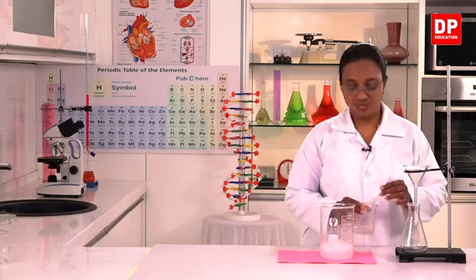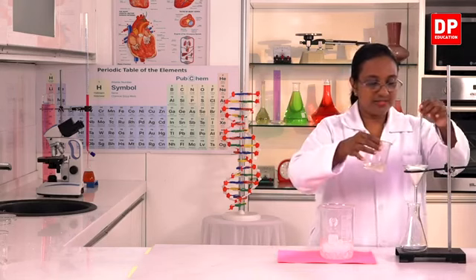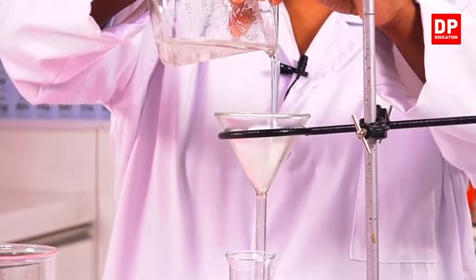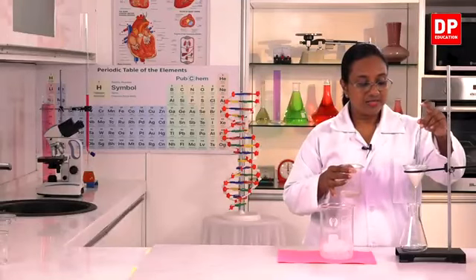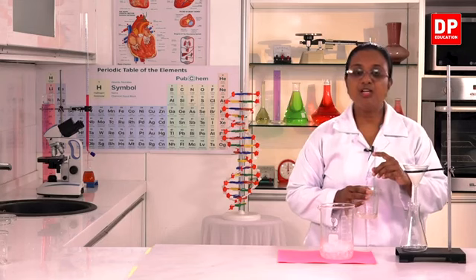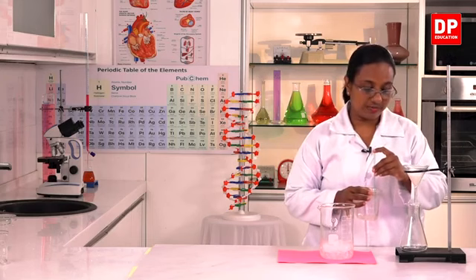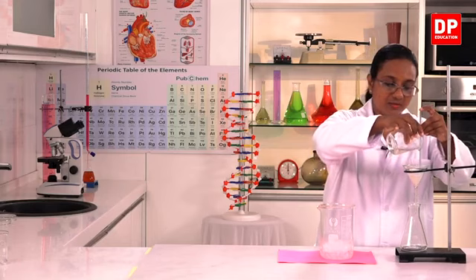Okay students, so I have the salt solution dissolved here at 80 degrees Celsius. Now I am going to filter it through the setup. You have observed this before, the filtration process. We have the conical flask, funnel placed on the stand, and inside the funnel there is a filter paper. You have to fill the solution to about 3/4 of the filter paper so that it doesn't flow out of the filter paper. And when it is getting filtered, I can transfer more solution.